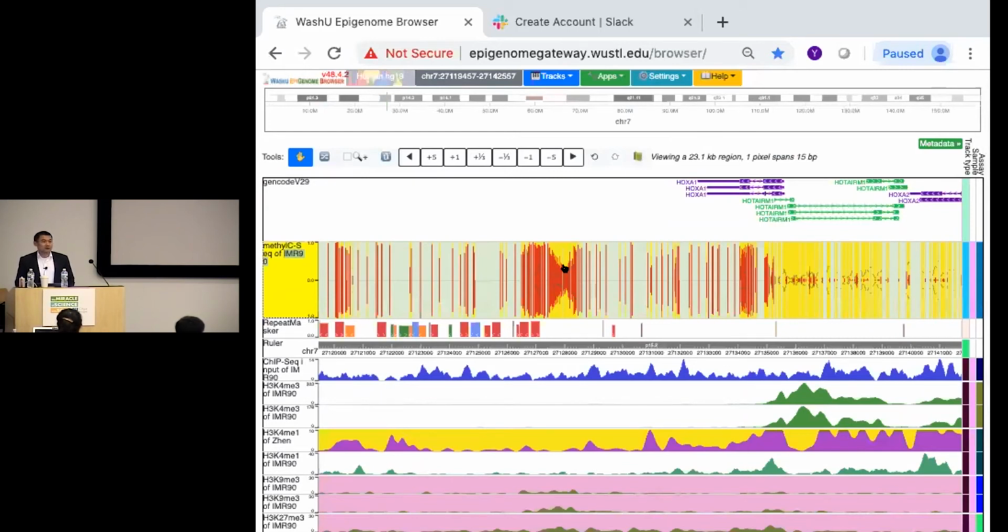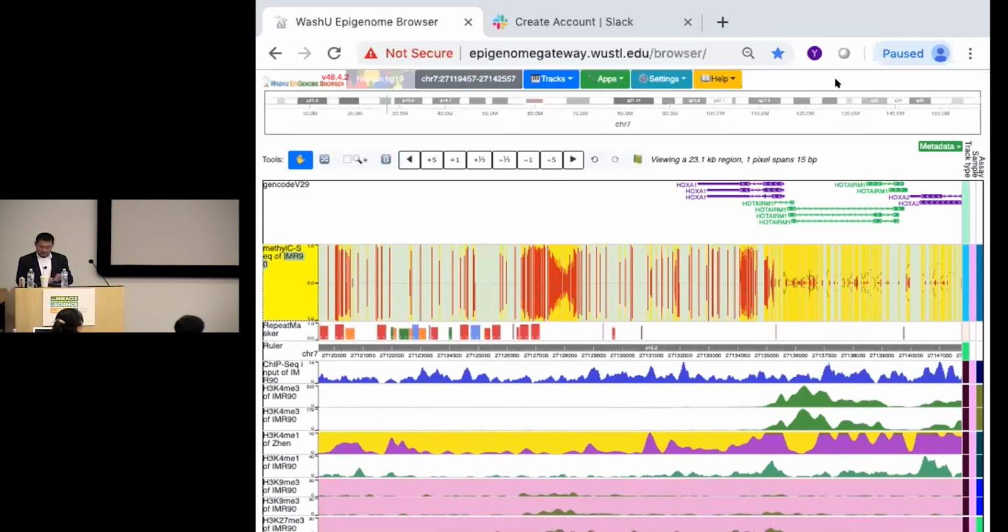If there are questions and needs, you want to see how certain things are done, please feel free to just interrupt me, okay? So, during the break, I was asked, how do I find the data of interest? Okay, so let's start from there. We now know how some of the tracks behave. So now let's find more data.